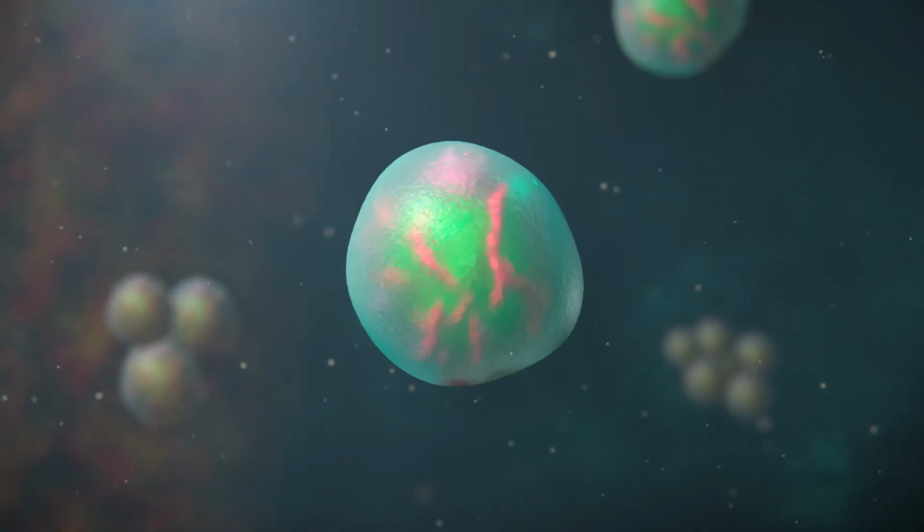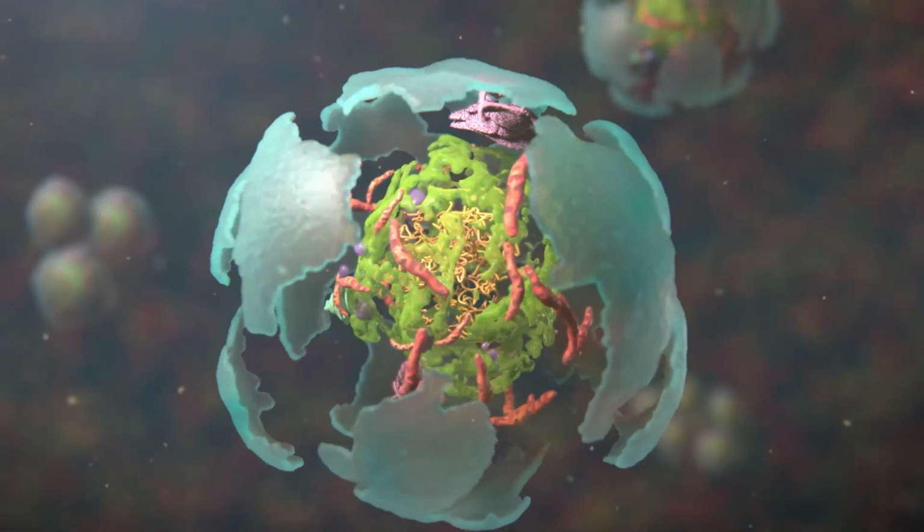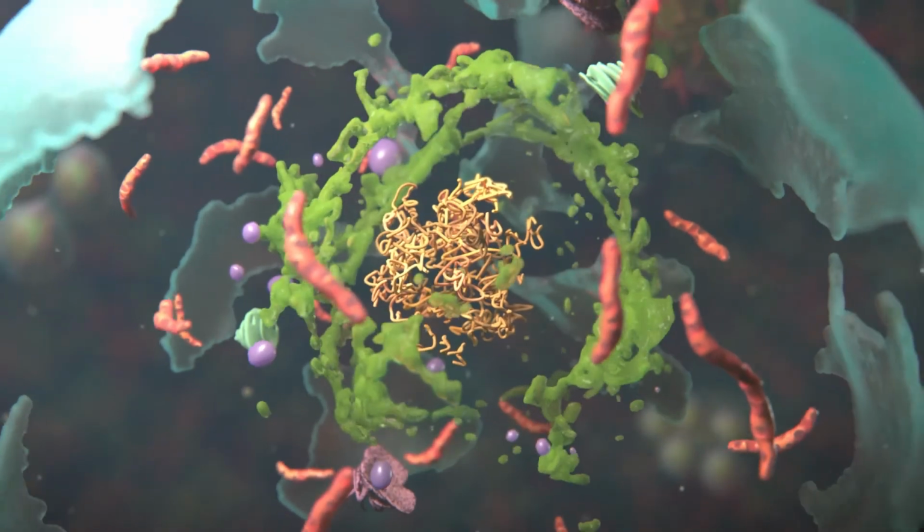We are able to extract DNA from cells using a special combination of buffers and enzymes. Breaking open a cell with detergent is a bit like doing the dishes. We use hot, soapy water because that detergent is really good at breaking up fats. The detergent breaks open the cell and the contents spill out into the tube.